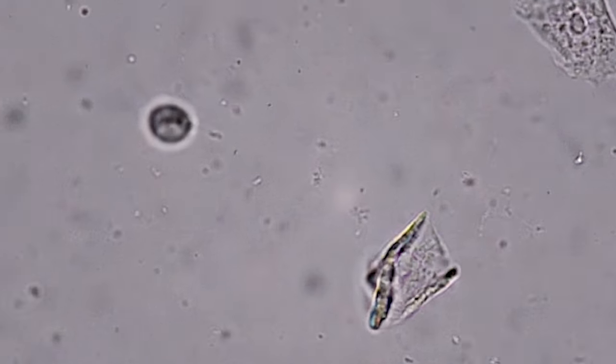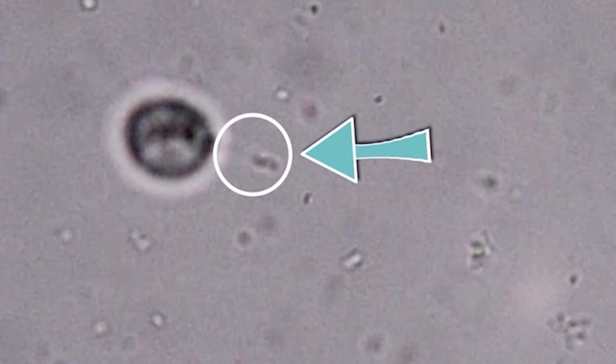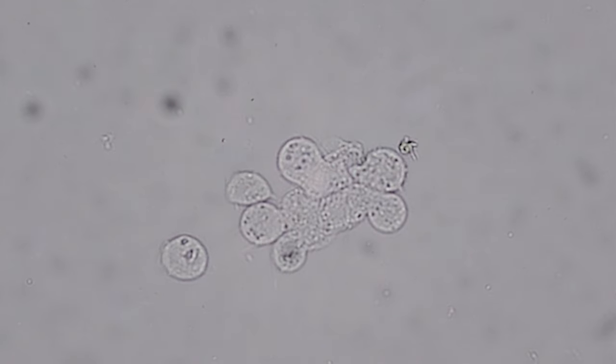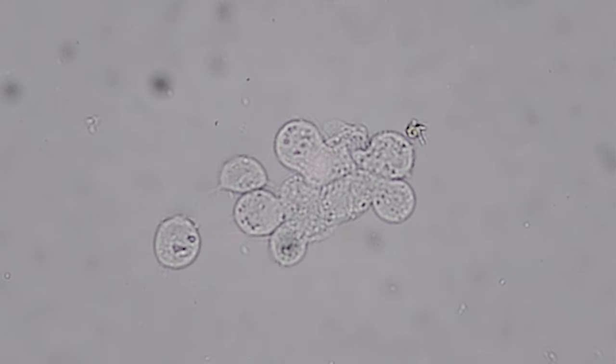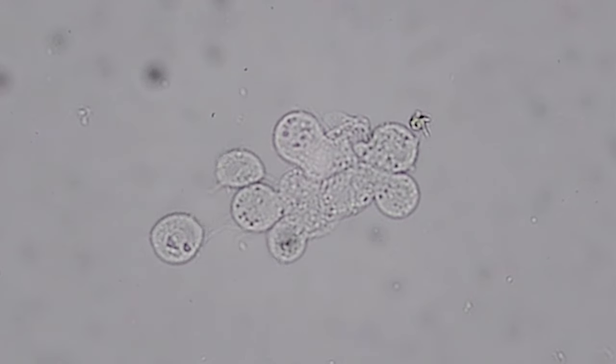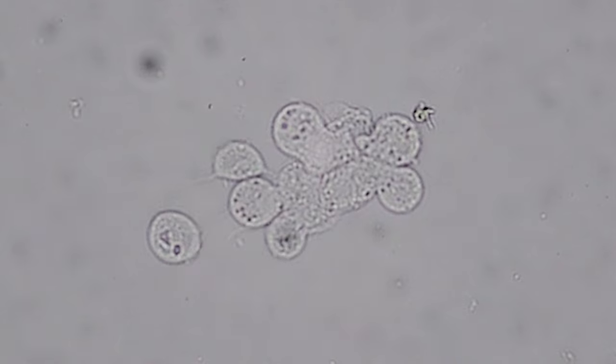Another structure, called the auxostyle, helps the organism attach to the vaginal wall. As you move around, you can see some Trichomonas start to round up and begin to die. This is why it is important to view the slide within a 15-minute time frame.